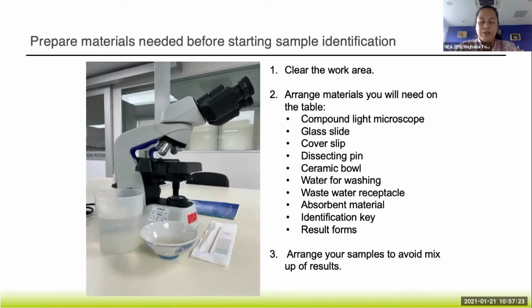And then when you're dealing with your samples, going back to this, you can arrange your samples in a tray so that you don't mix up any of the samples. We are setting the night catcher before sunset because you cannot set it at night. We have to leave it there. So it should be starting to collect just before the sun sets. But if you watch the video, there is a PDA where you can actually set what time you want it to start collecting. It will not turn on until the time that you set it. But you can deploy the trap in the site before they start collection.